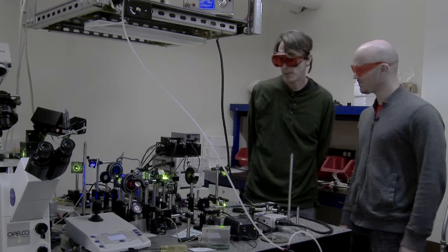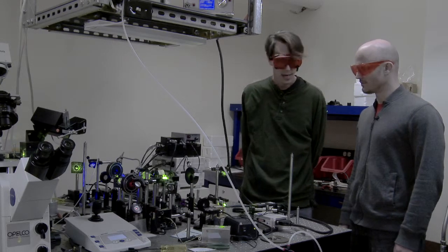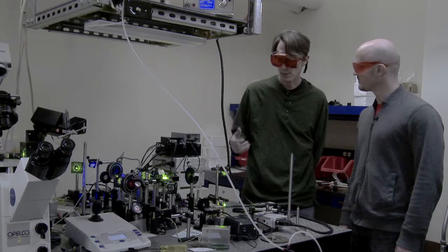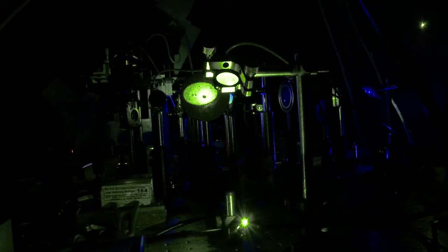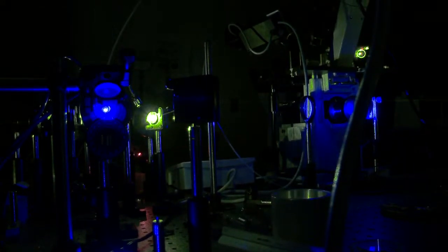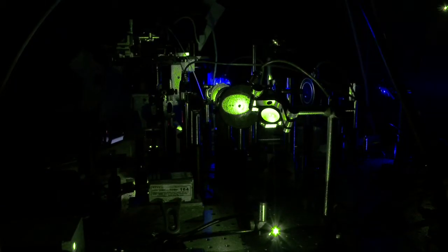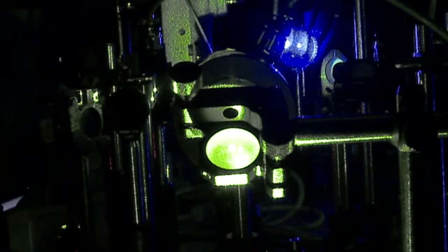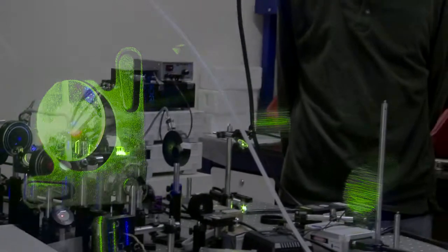Well, the way we make measurements on these proteins is that we attach fluorescent dyes to the proteins and those fluorescent dyes interact with laser light that we send in and then they glow in different colors. And so, the way we make the measurements, we actually measure the color that they emit, but all of these lasers on the table are used to probe the proteins and to turn on these dyes. And so, we have a lot of different colors of lasers that these mirrors can all manipulate the light and route them into the microscope at different places and send them onto the proteins. Cool.